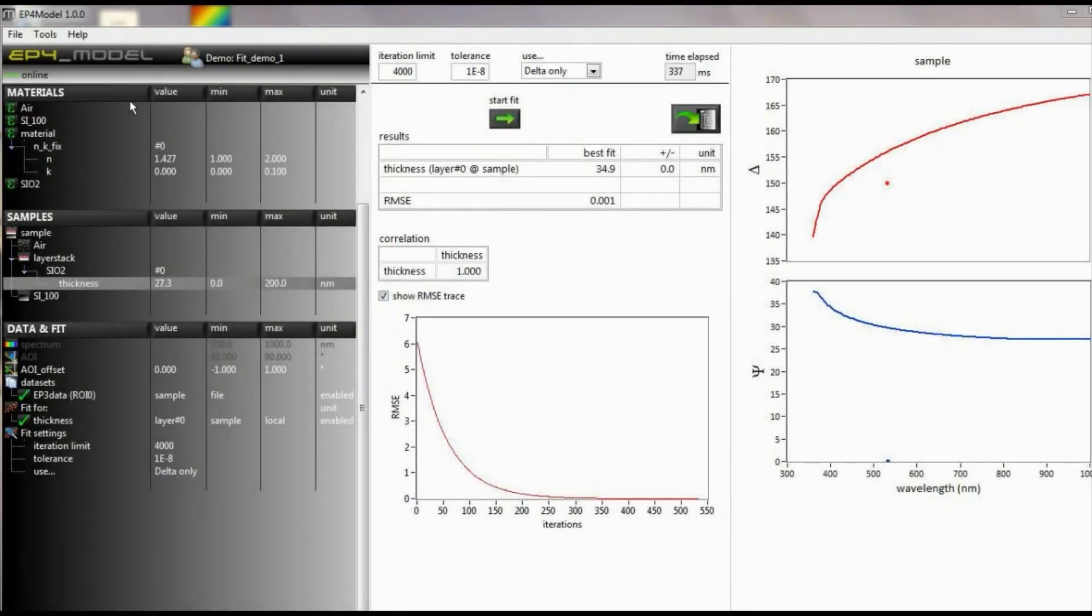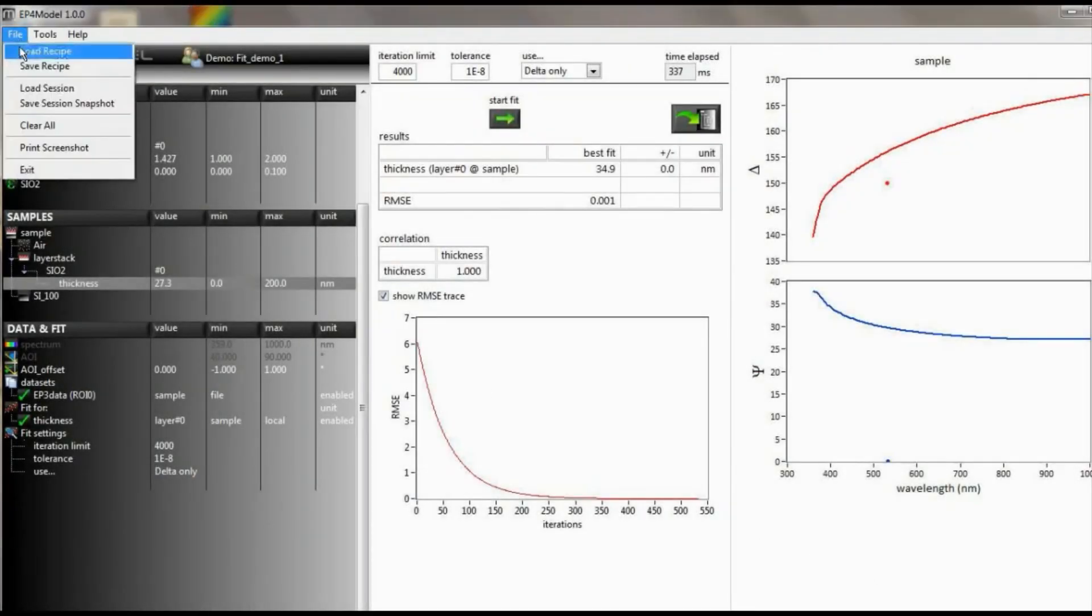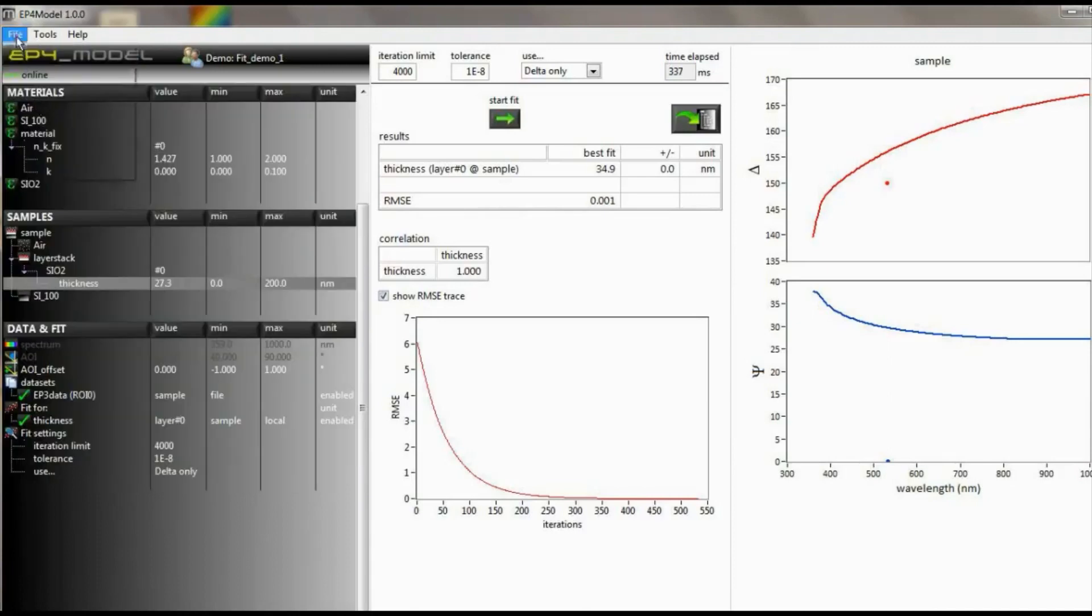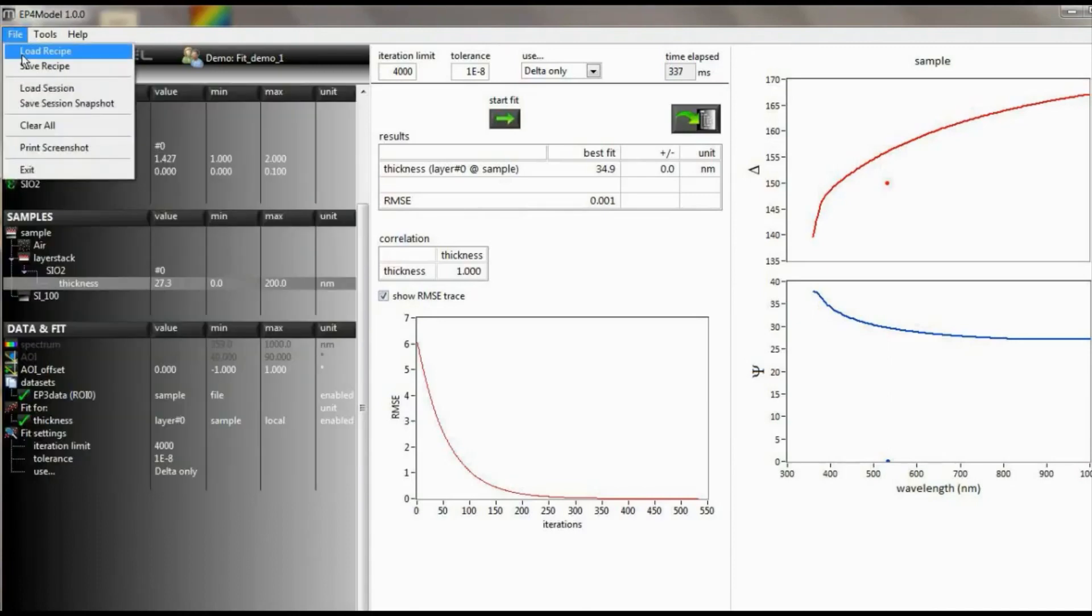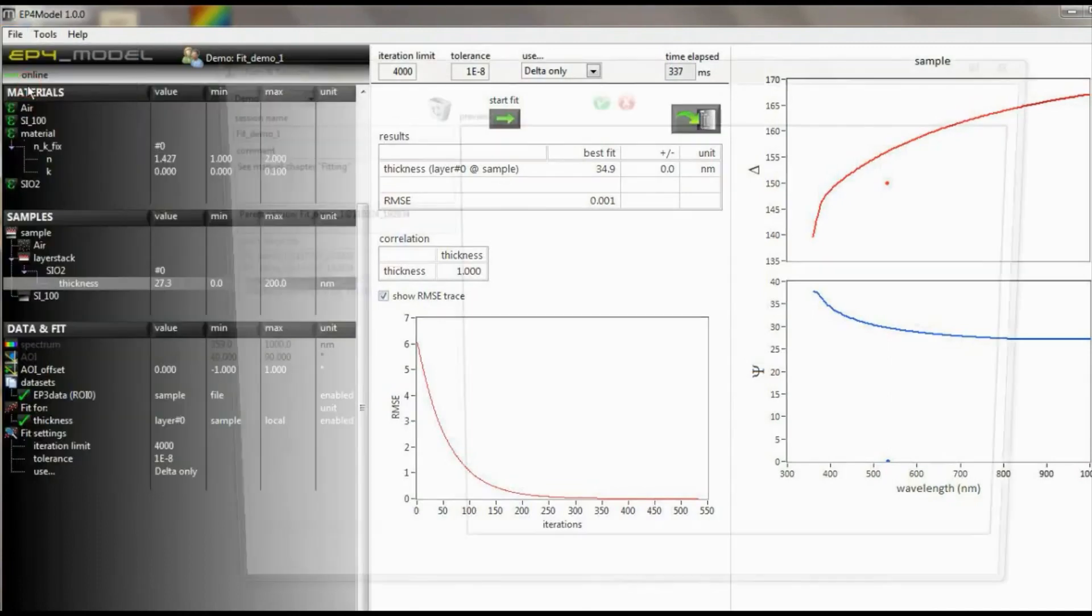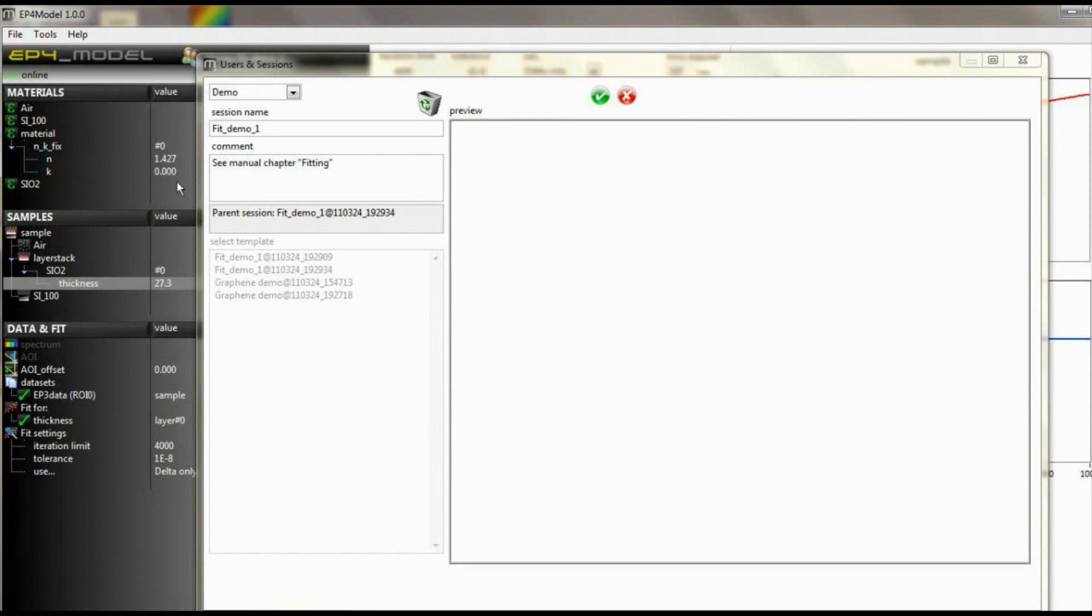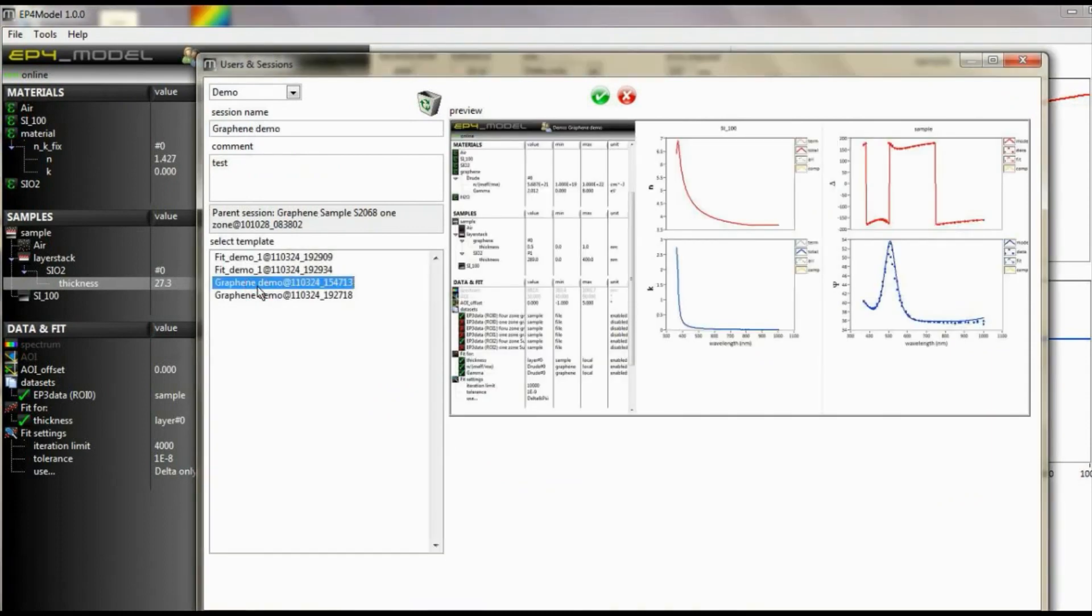To finalize the work, you may save the complete session. All data, fit parameters, and curves, as well as a screenshot of the current session will be saved to make a later import easier.